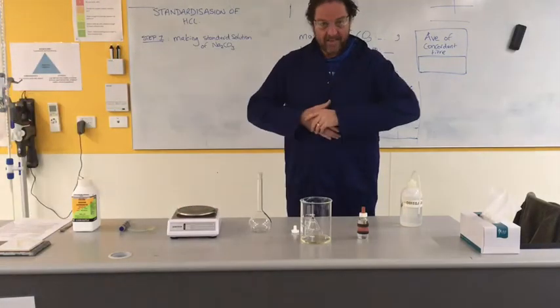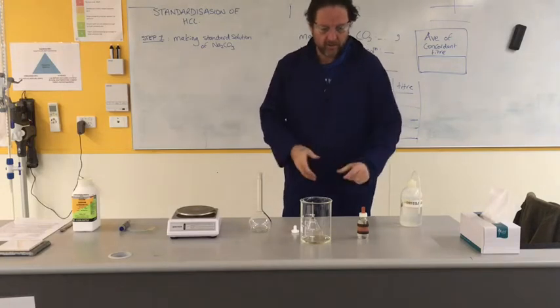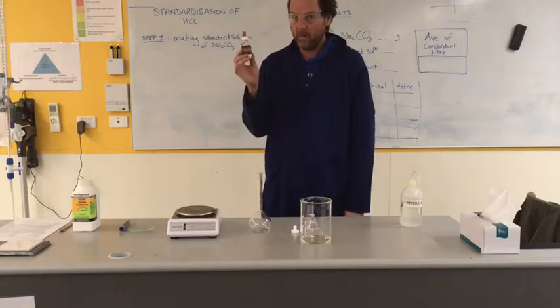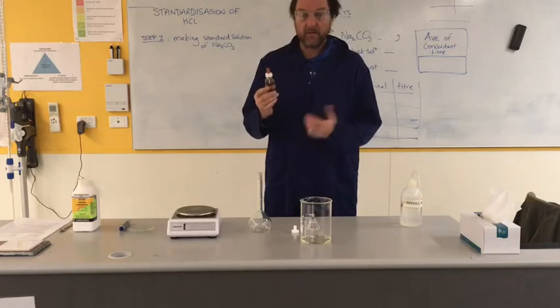Welcome. Today we are going to standardize - find out the exact, more accurate concentration of this hydrochloric acid. This hydrochloric acid on its label says it is 0.1 molar. We can do much better than that; we can find it to at least three significant figures, so why don't we try.